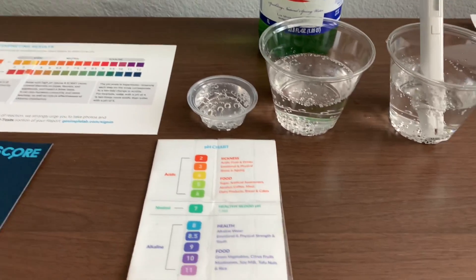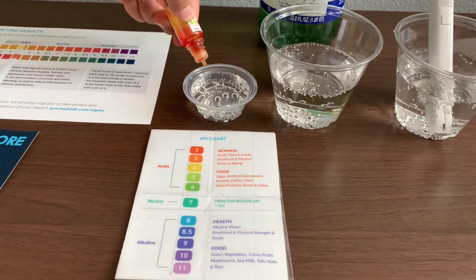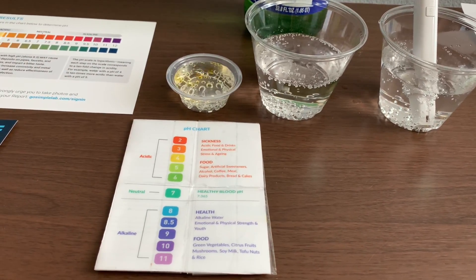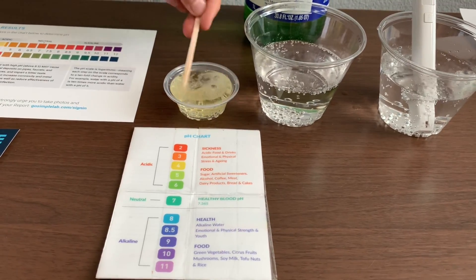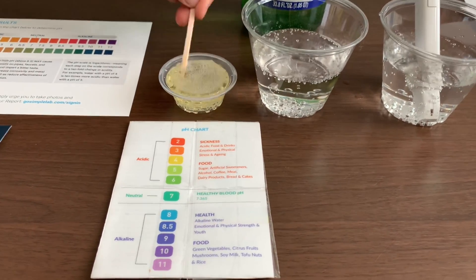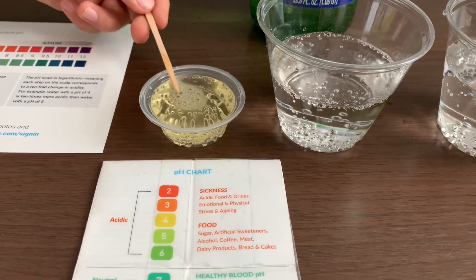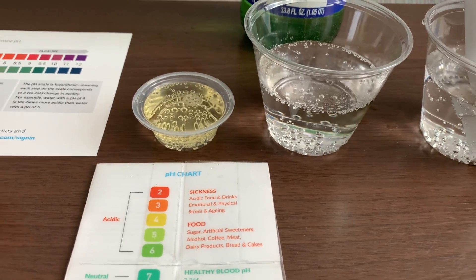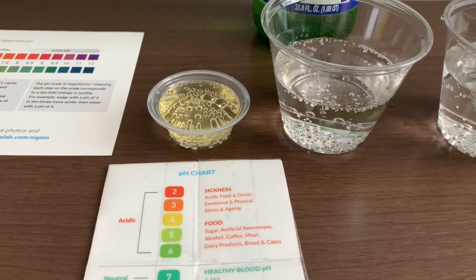Now we're going to test the pH level using the drops. Do two to three drops and stir it for a better result. This is also a 4. Both of these are acidic.